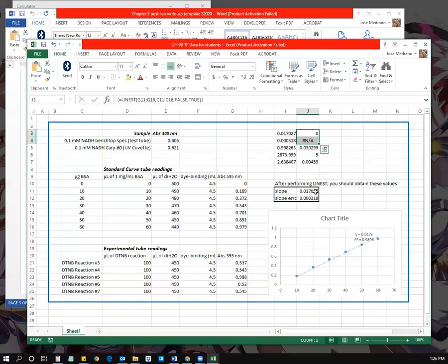y-intercept. But for the purposes of this biochemistry course, we don't allow any y-intercept values to occur because we want to obey Beer's law. If a sample has 0 concentration, its absorbance should also be 0 as well. We're not going to have any B value or error to worry about. We're only going to have to worry about the slope and also its corresponding error.